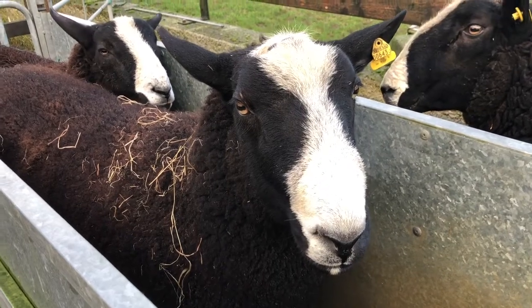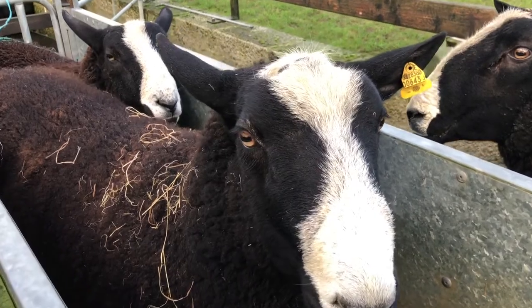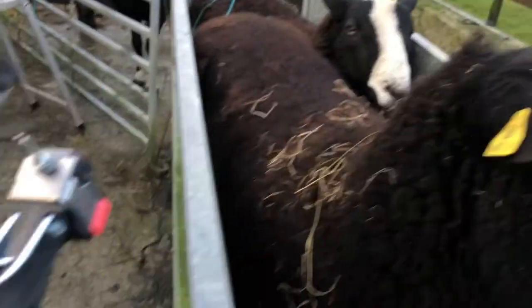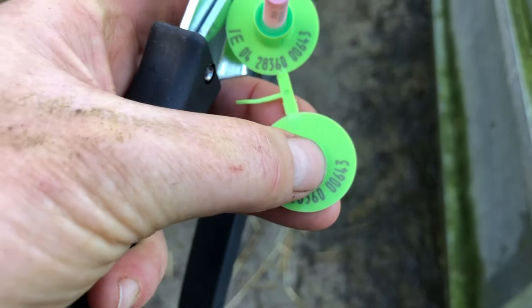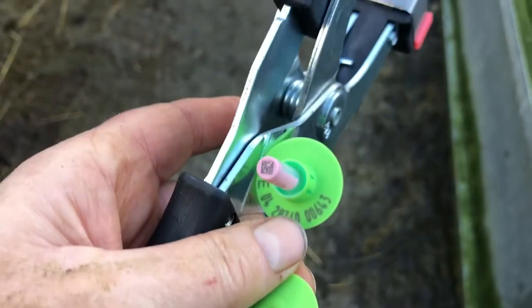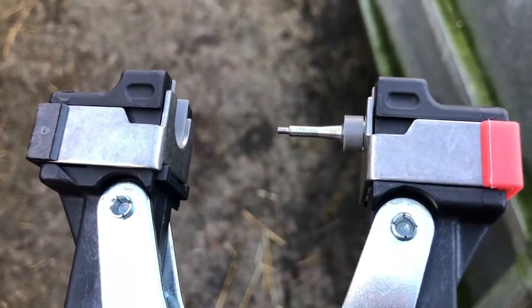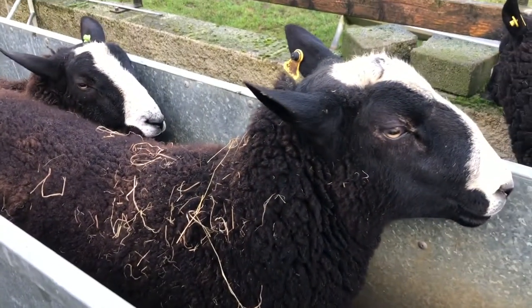We're going to genetically ear tag this ram. The ear tag number in his ear must match this ear tag number here — you can see the 643 there. I have to load the male and female part on this ear tag apparatus and then punch it through his ear.